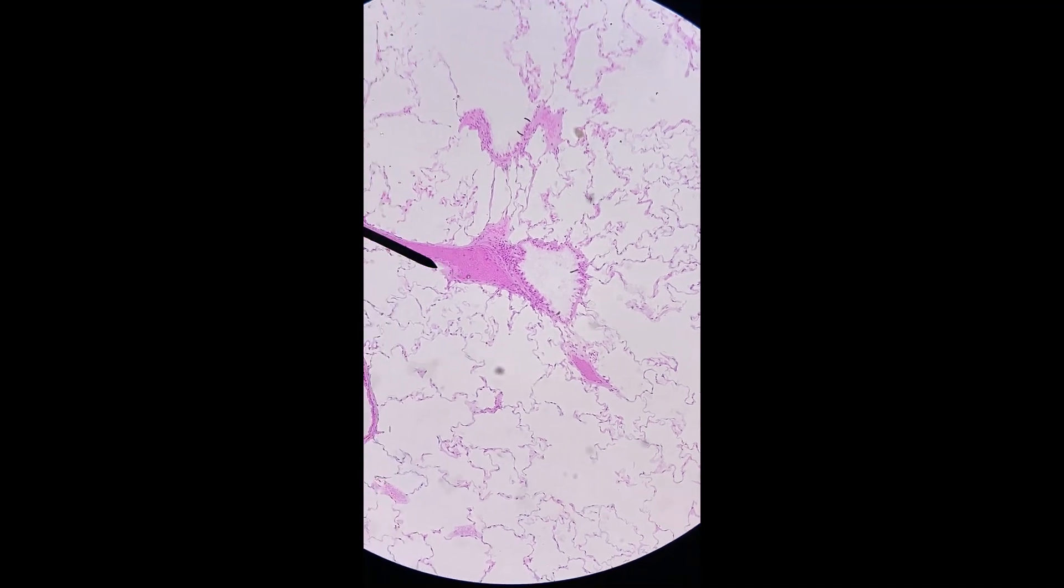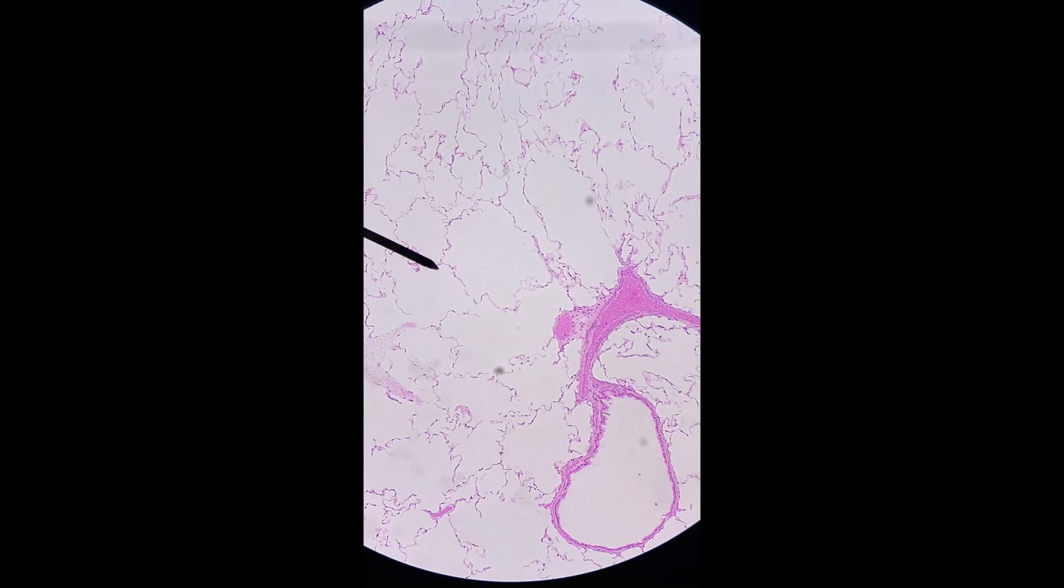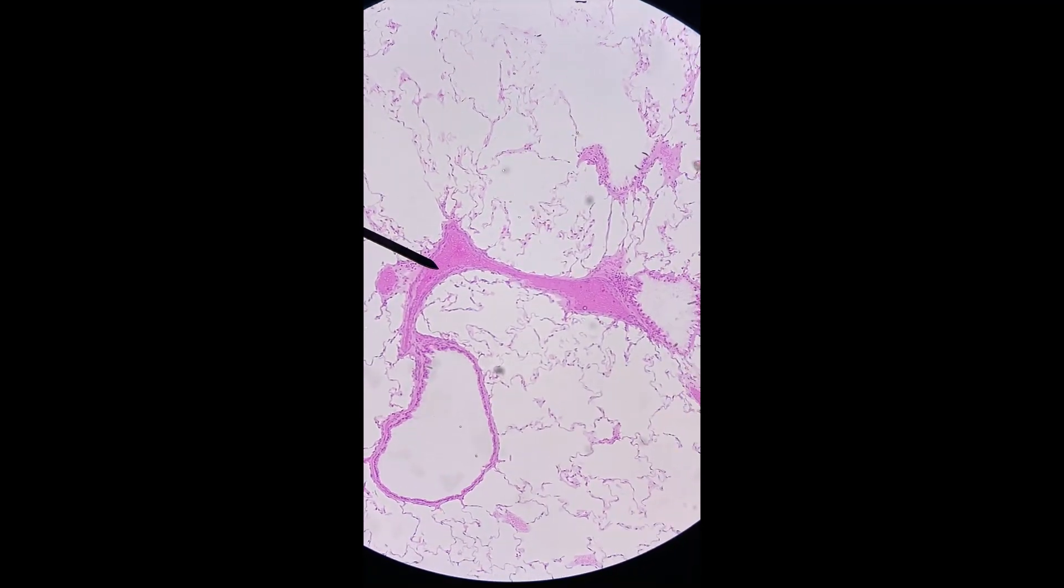I'll go back to medium power. Now we can see that same bronchiole from a greater distance. We'll pan around there, see if we can't find any blood vessels that I know for sure are blood vessels. That probably is one, but it's been cut weird.